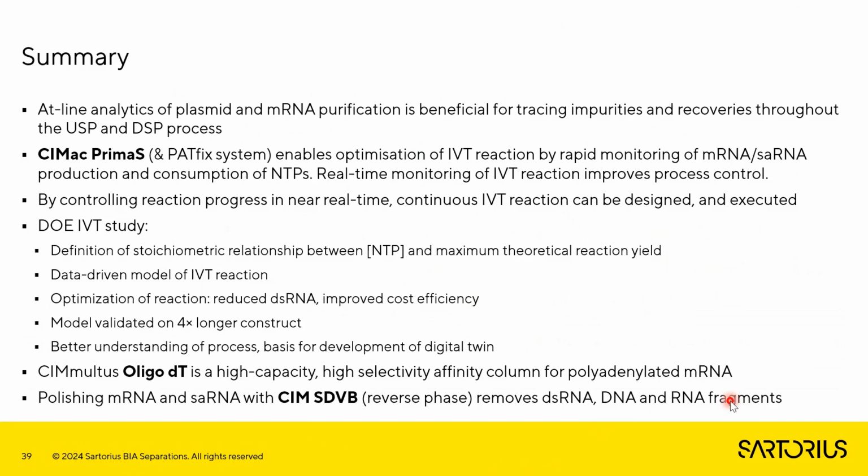remind you what you've seen. So I really wanted to convey the importance of quality by design approach in terms of mRNA, and hopefully I've shown an interesting case study of how we use DOE as a core part of QbD approach to really get a good understanding of the IVT reaction from the process perspective, how we were able to reach unprecedented high yield of IVT, 25 gram per liter, purified the mRNA with affinity chromatography, and then polish it off with reverse phase to really have a high yielding, but also high purity, I'd say extraordinarily high purity of mRNA as well as saRNA product. Very happy to take any questions.